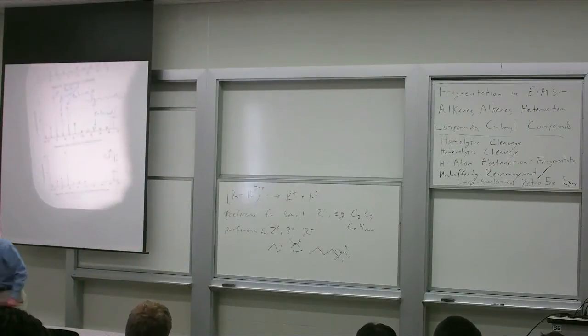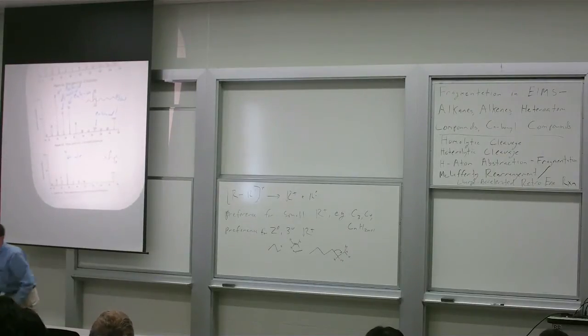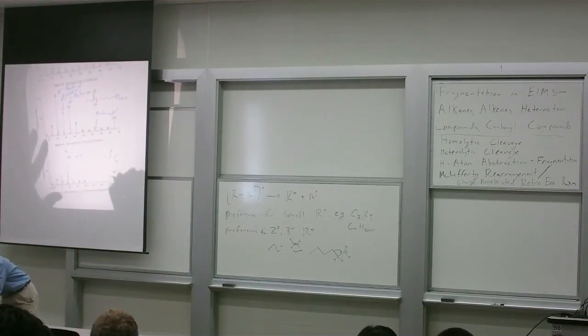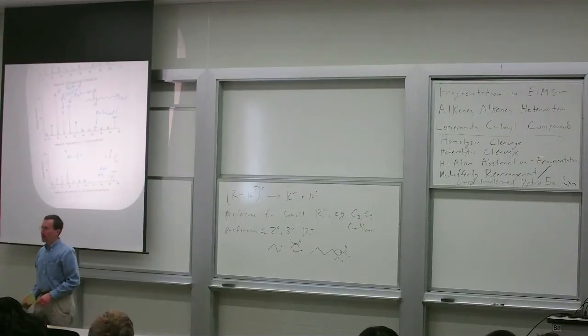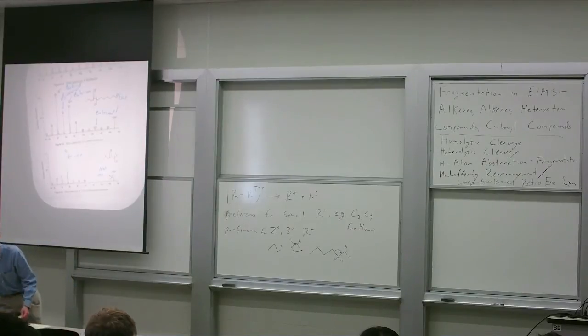By the time we get to some really easy carbocation pathways, right, everybody loves a tert-butyl carbocation. By the time we get to really easy carbocation pathways in this highly branched dodecane isomer, now you don't see the molecular ion at all, and you see a great big tert-butyl carbocation. All right, so that's what I want to say about alkanes, and of course you'll see some of this fragmentation in compounds containing alkyl groups, although often the fragmentation will be focused around the heteroatom.